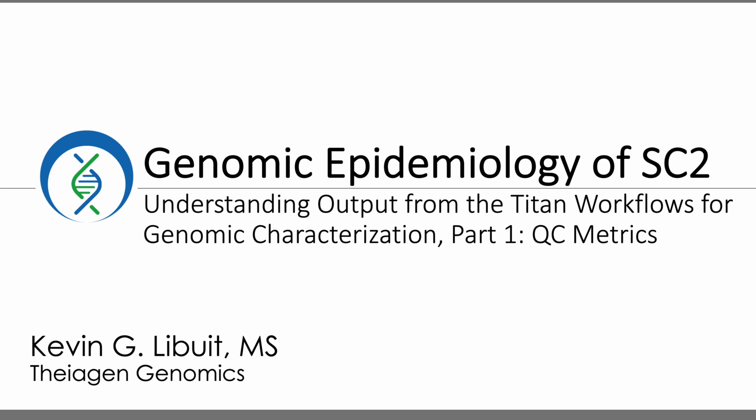Today's video is part 1 of 2 for understanding outputs from the Titan workflows for genomic characterization. In part 1, I'll be focusing on defining QC metrics made available by these workflows. And in part 2, I'll be discussing clade and lineage outputs that are also generated. Alright, so with that, let's get into it.